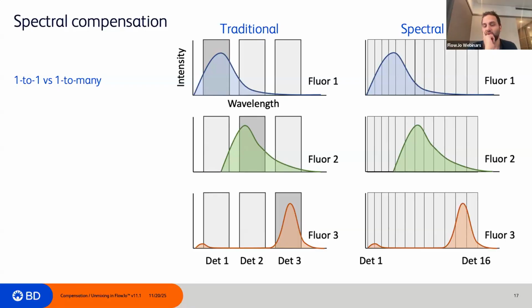Now, if you want to do your size gating alone, or replace the automatic gates from FlowJo, you can. Since those are, of course, single stain controls, we cannot have a live dead staining in there. But we can add an additional gate in order to gate out the doublets and use this as our size gate if we think we have a lot of doublets.